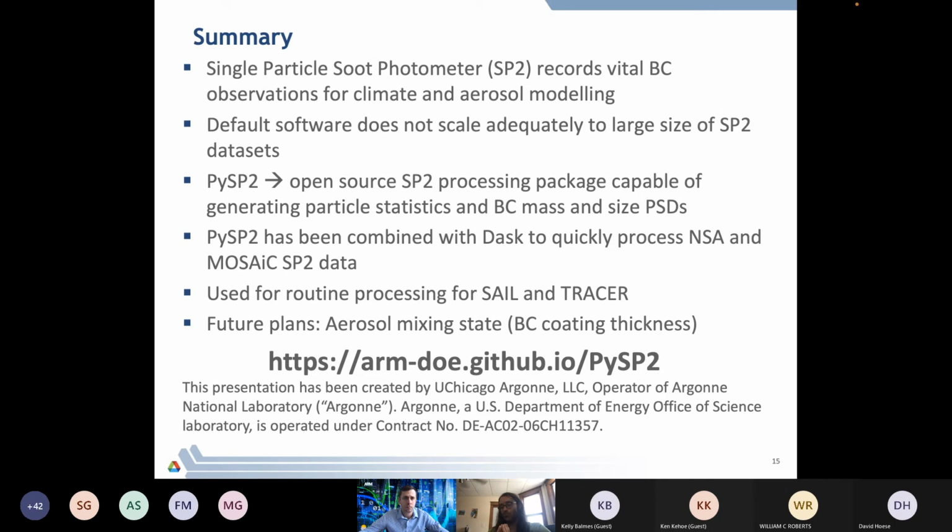That approximation works better when we look at the scattering channel. Once you get to the incandescence, then we don't rely as much on fits because it can be off Gaussian. So we just look more at where the peak of the distribution lies within the histogram data. But for the scatter distribution, through the theory, it should be approximately Gaussian if there's a single particle present.